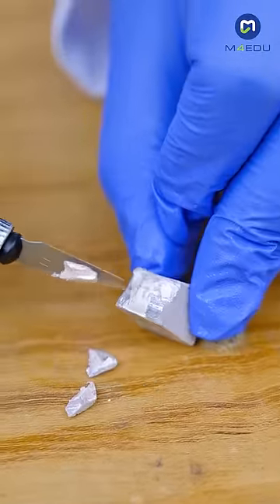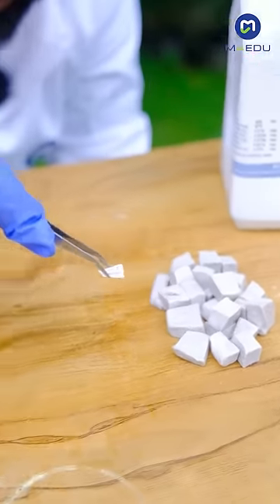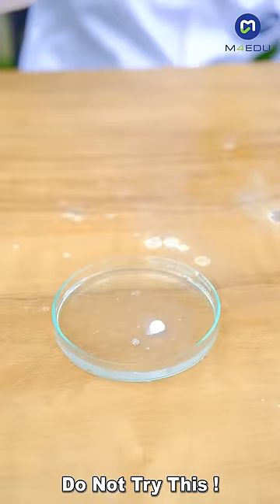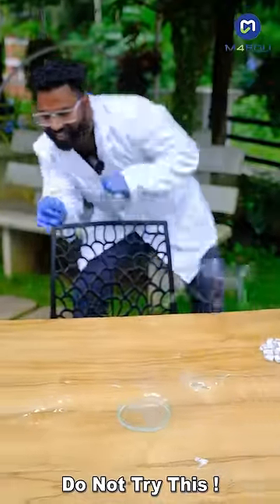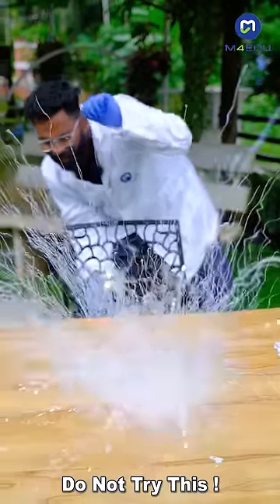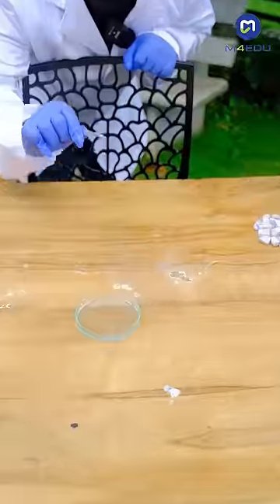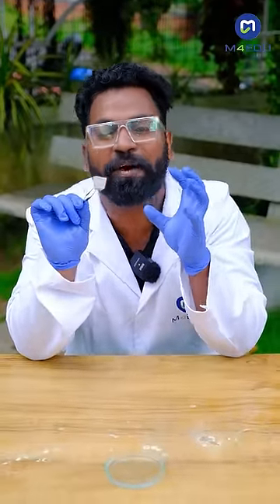Please note that the oxygen level is high. We've recorded this in a single day — the sodium material can be used. First we put a single piece of sodium metal that needs to be cut. This is the outer surface of sodium metal.